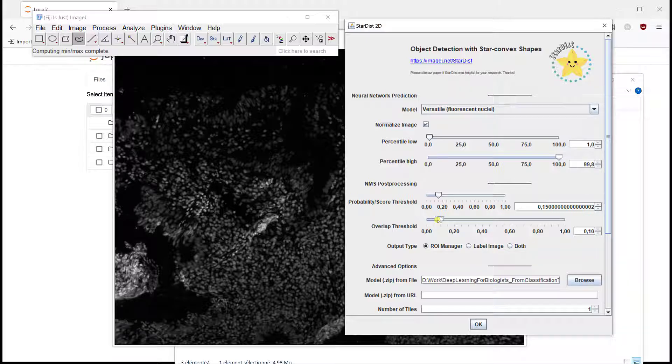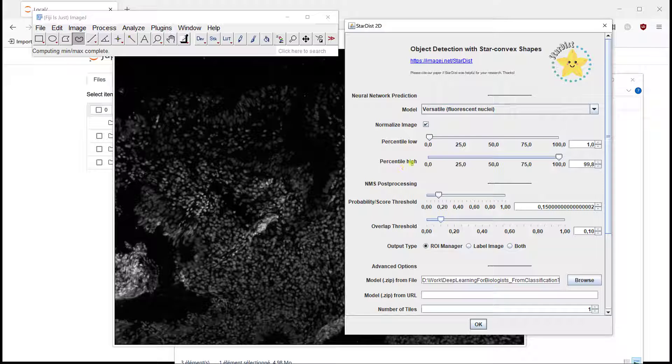Because I don't want my nuclei to overlap, I want to segment them on a pixel-to-pixel basis, I would say.